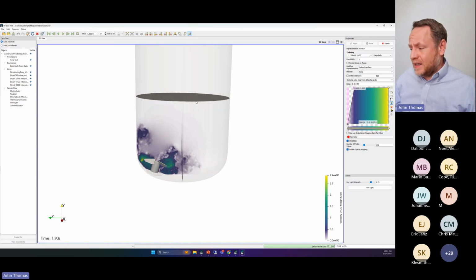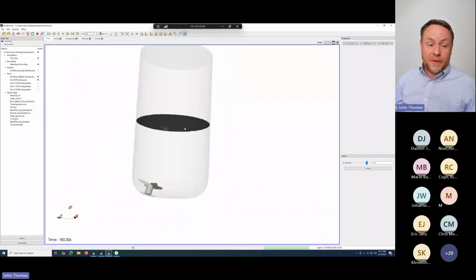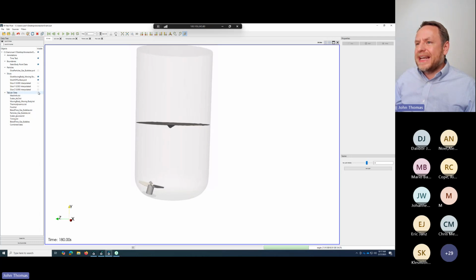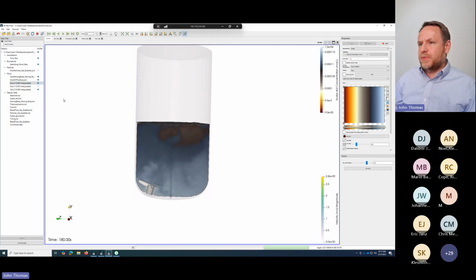So I'm prepared to handle a vortex, and I'll kind of sneak peek here. Under some cases, I may get a small vortex. This is a previous case I ran to kind of have one coming out of the oven. But foundationally, I will not get lots of vortex in this system because I have a pretty tiny impeller. And so foundationally, I don't have enough kinetic energy to really disperse this guy.